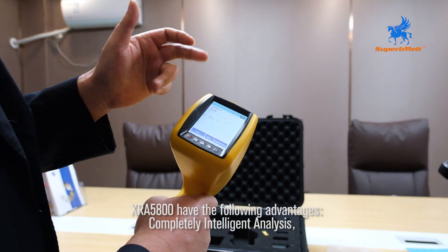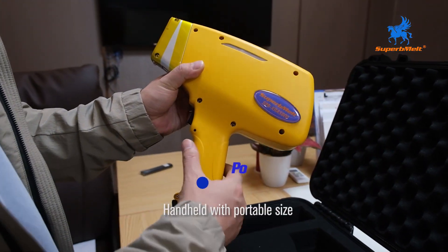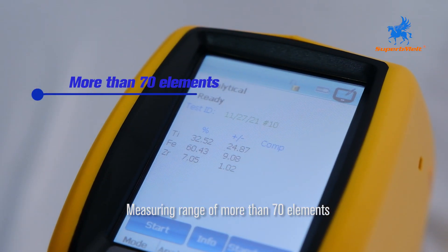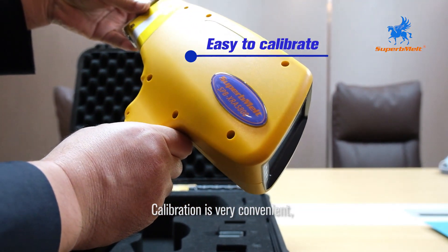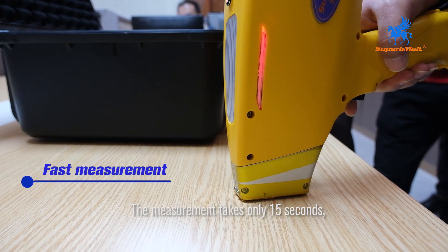The XRA5800 has the following advantages: completely intelligent analysis, handheld with portable size, measuring range of more than 70 elements, very convenient calibration, and the measurement takes only 15 seconds.